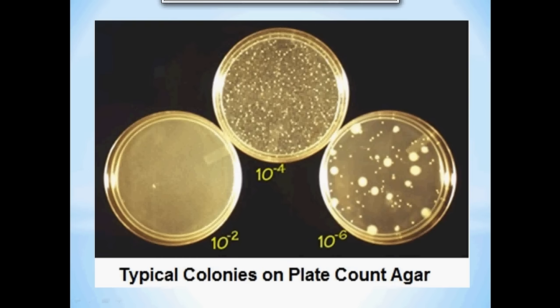will best depict how the dilution helps in counting the number of bacteria. In the second dilution, we cannot analyze or estimate the number of microorganisms. As we dilute to the fourth dilution, we can see the colonies, but it is very difficult for us to count. But as we go further into the sixth dilution, we can see individual, specific numbers of microorganisms, and as said earlier, each colony forms from a single bacterium. So if we count these individual colonies, we can say this many bacteria are present in that specific dilution.